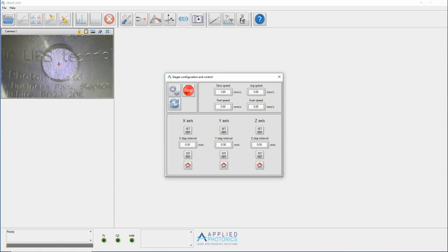Also in the lower section of this screen are buttons labelled Set Ref for each axis. That, when pressed, will set the current stage position as a reference position. Subsequently pressing the Go Ref button for the corresponding stage will make the stage return to this set reference position.